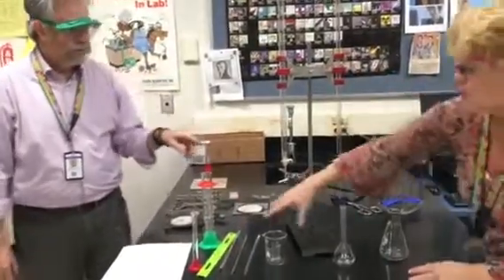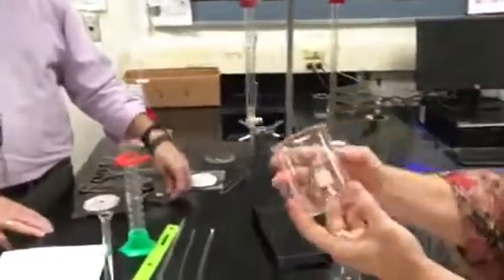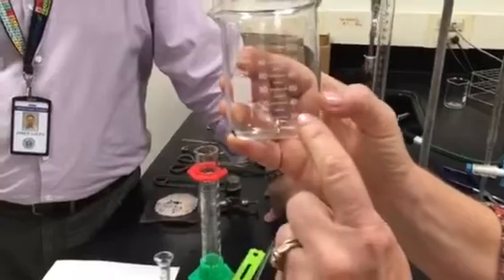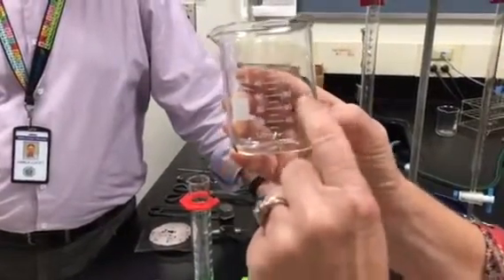So you want to talk about not the graduated cylinder. Let's talk about the beaker. Here's the beaker. This is a 100 milliliter, actually 140 milliliter beaker. And what do the graduations go up by? They go up by tens, 20, 30, 40, 50, 60.